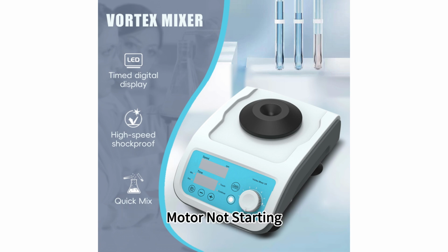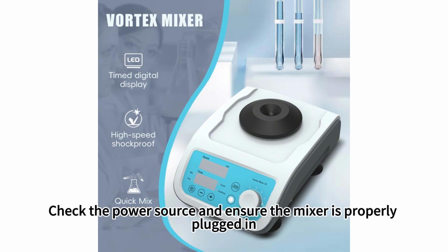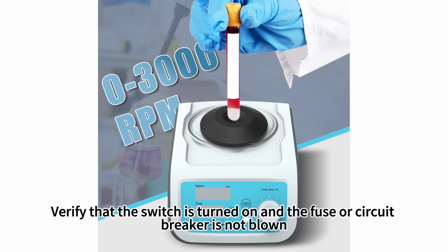1. Motor not starting. Solution: check the power source and ensure the mixer is properly plugged in. Verify that the switch is turned on and the fuse or circuit breaker is not blown.